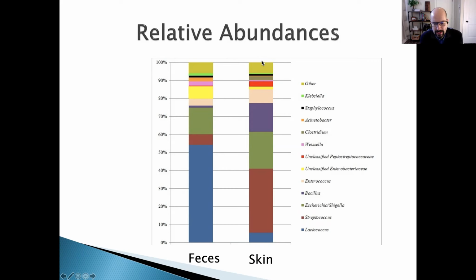So I get many Lactococcus, Streptococcus, and it's quite obvious this is a milk sample, but don't tell anybody. Just for teaching purpose here. So I'm looking at this plot, and I'm gonna ask you, which sample had a higher load, a higher number of bacteria? Feces or skin?